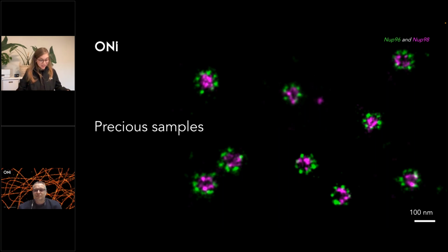Very good. I have one interesting question that we sometimes get from our users: can we also image plant cells with dSTORM? What do you think about plant cells? That's a good question, but it's a little bit difficult. Even if you're able to isolate cells from the plant, we all know that they have chlorophyll.